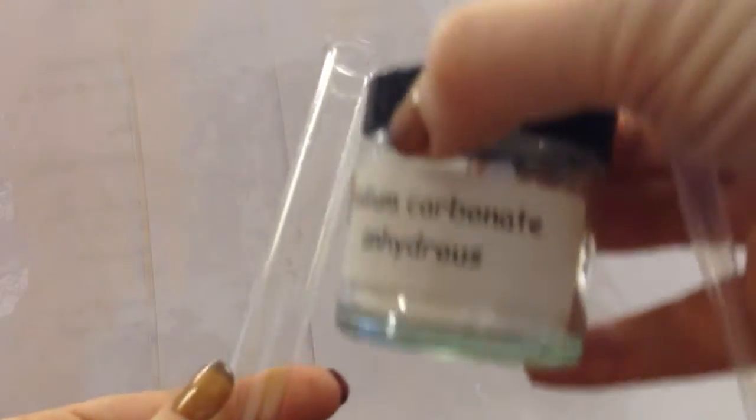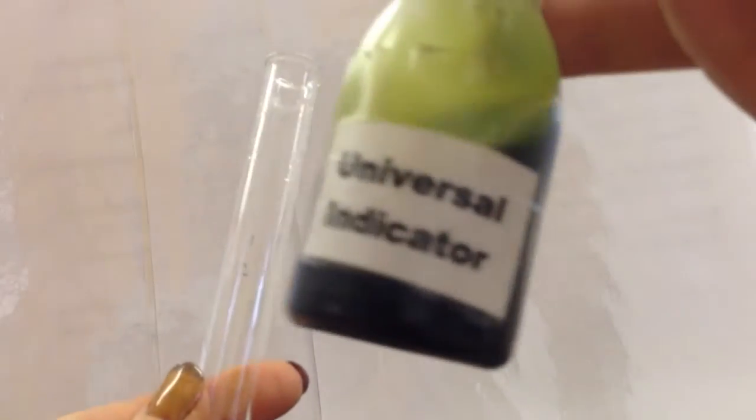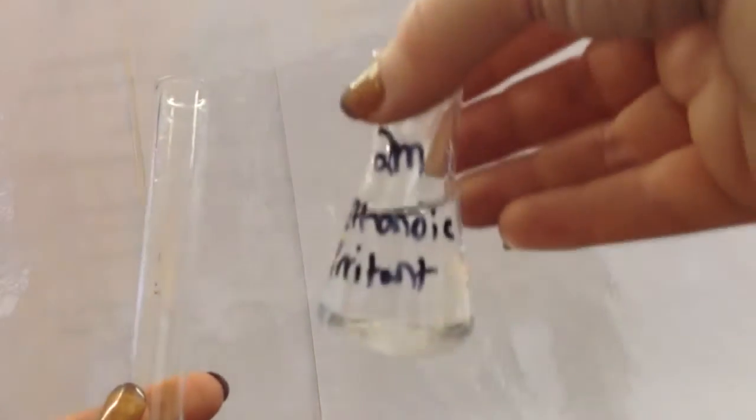I am going to make a rainbow test tube. I have my test tube, I have some sodium carbonate, some universal indicator, I have two molar ethanic acid, I have some water and I have some four molar ethanic acid.